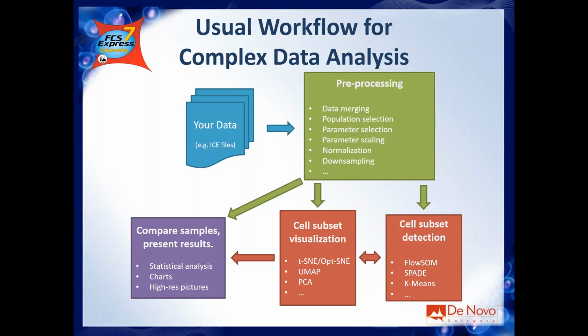At some point, you have your scaled, normalized, clean data, and you start running the core part of the analysis. And the core part might be some clustering, some dimensionality reduction, maybe both. The beauty of the pipeline is that you're not running your algorithm as a standalone algorithm. Let's say you're not running tSNE on its own, and then UMAP on its own, and then FlowSOM or any other clustering on its own. You are running all those guys in the same pipeline.